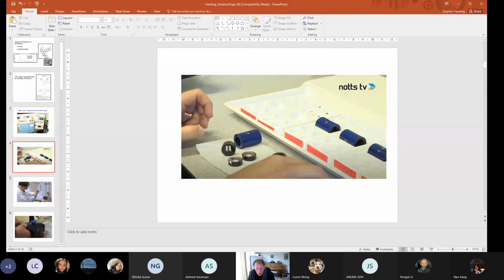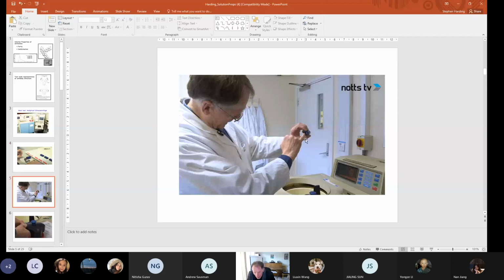And these are transparent windows here which go at the end. So that means when the cell is fully assembled, you can pass light through them of the appropriate optical properties. So you can actually record the sedimentation process as the solution is spinning at very high speed. So you spin like this, and the centrifugal field goes radially outwards away from the center of the rotor. There we are. You see that this is the cell looked at end on. See those two little channels?